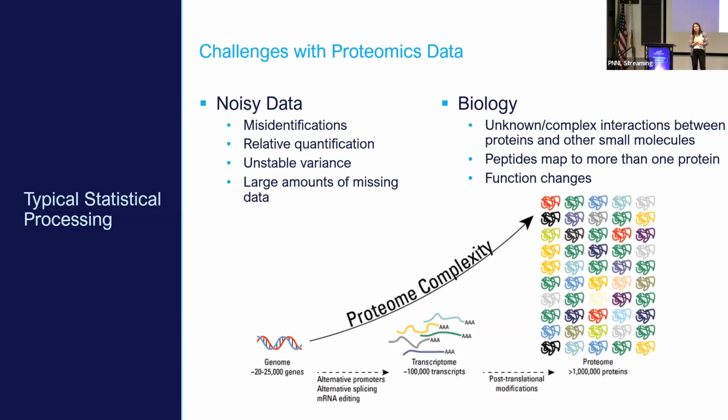But batch effect correction is still an evolving field of research, and there are quite a few methods available, but one of the things that's been missing is a way to compare them to each other. So how do you know for your data set that the batch effect correction method that you're applying is not making things worse or is even doing anything? So similar to when I talked about data normalization, right? How do you know what the best method is? There's not that analogous heat map with the recommendation of this batch effect correction method being the best.